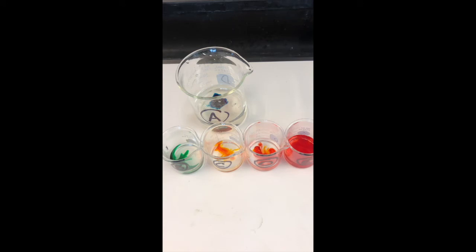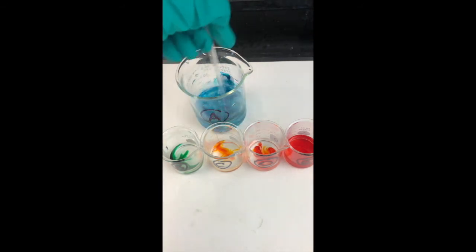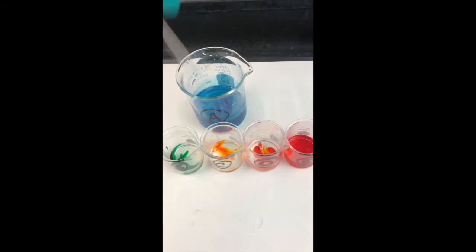It's important to get these colors right because if they're too dark, they'll bleed into each other and the rainbow won't show out right. We want to give a quick stir with your glass stir rod. Make sure to wipe with a Kim wipe as we do this so our colors don't get skewed.